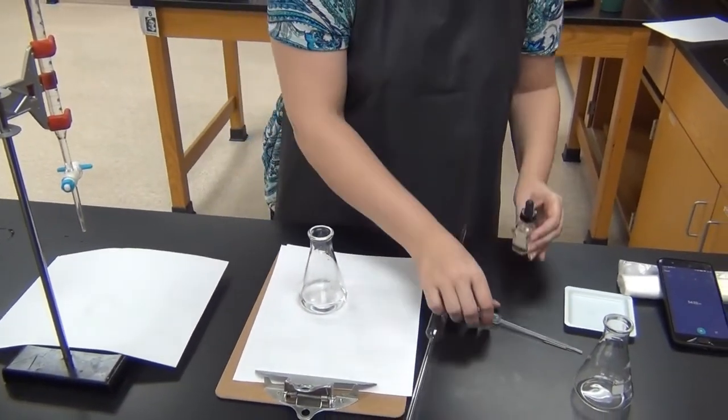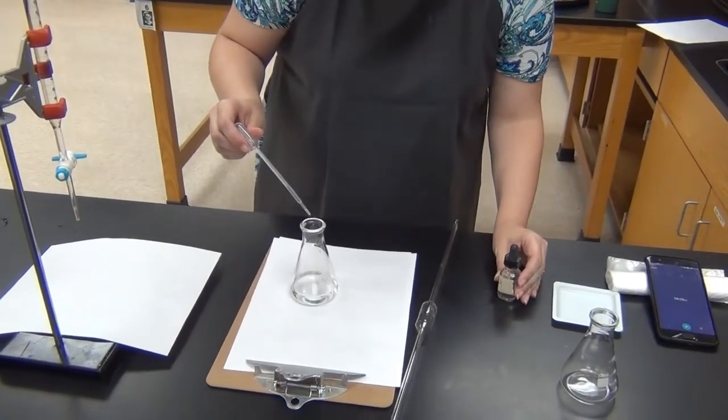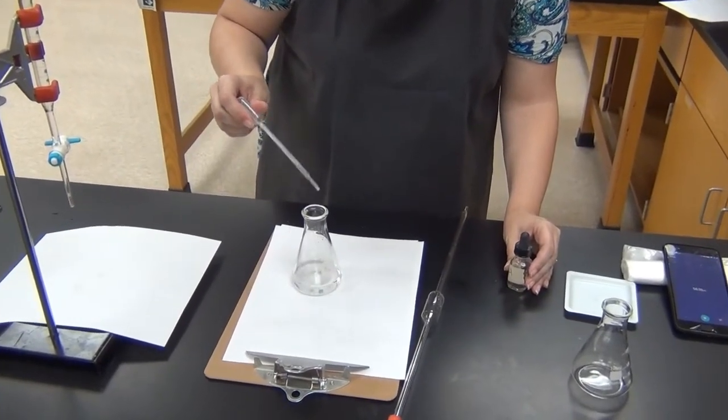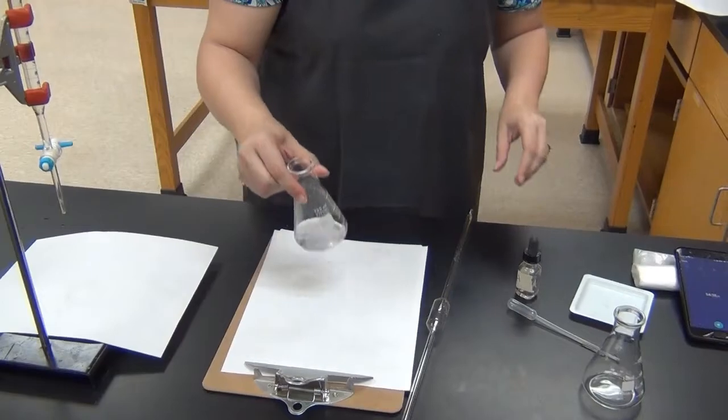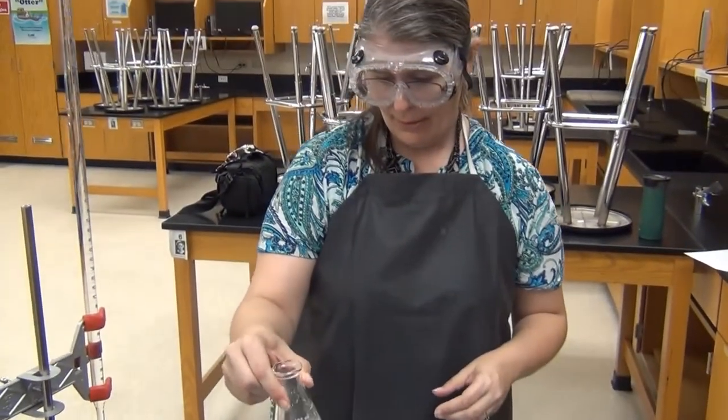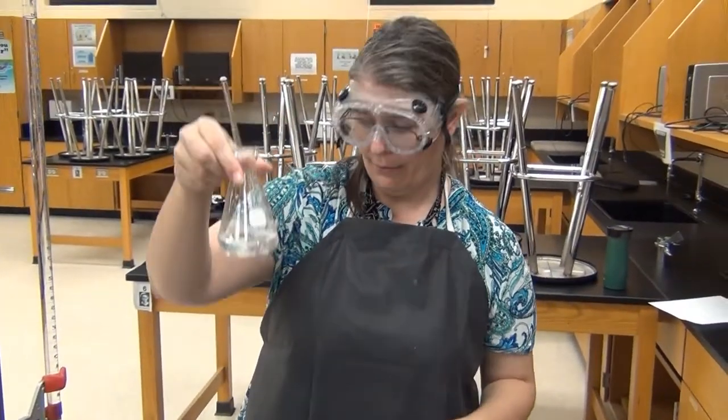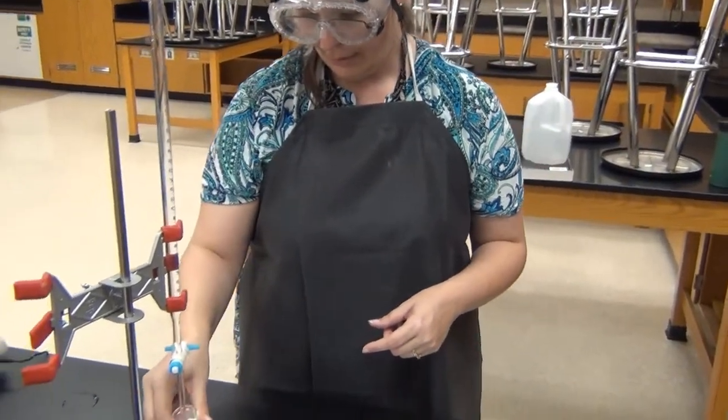As before, I need to make sure I put in the indicator, just a couple of drops. Just two or three drops is plenty. Swirl it around so that it's all mixed in, and now I have my starting clear colorless sample.